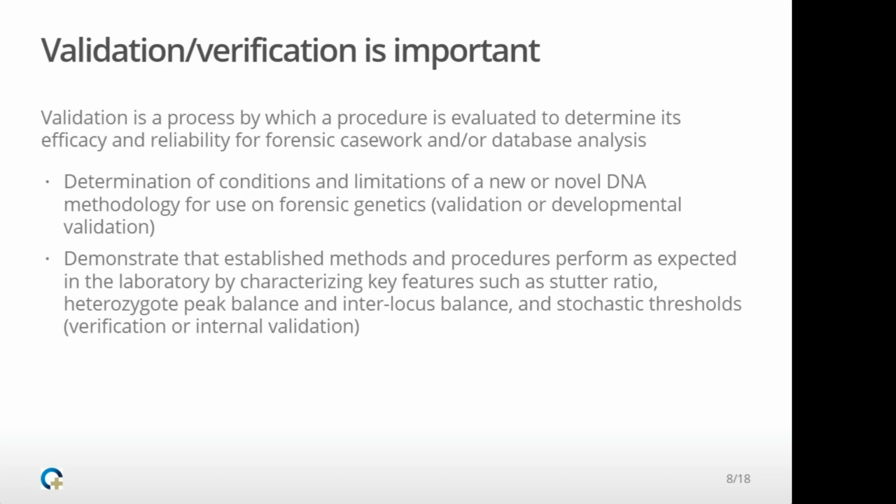Another way to say it is, if you develop your own STR kit, you will go for a complete validation or a developmental validation. And if you start using a commercial STR amplification kit, you will go for a verification or internal validation.